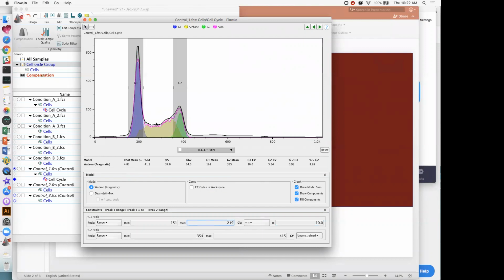So the model that I'm generating here is not fitting quite as well. And you can step this back a little bit one by one to see if some of these minor changes are going to improve the model significantly.